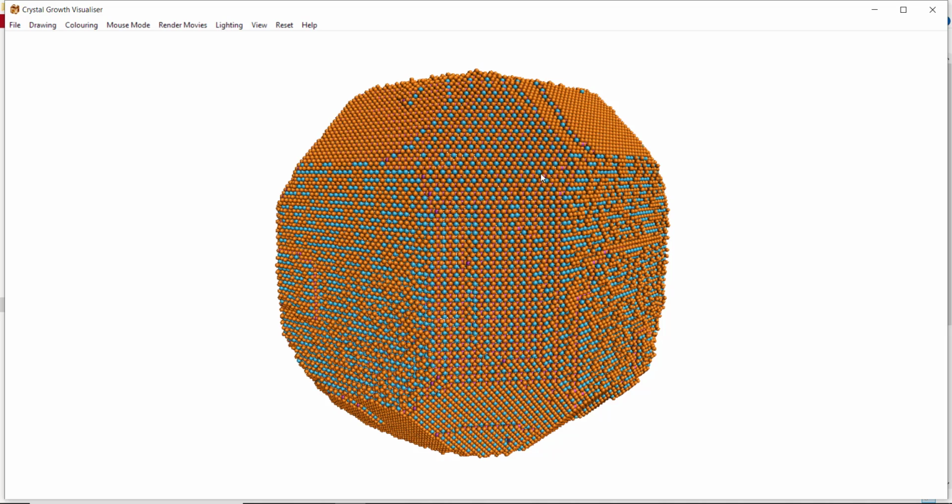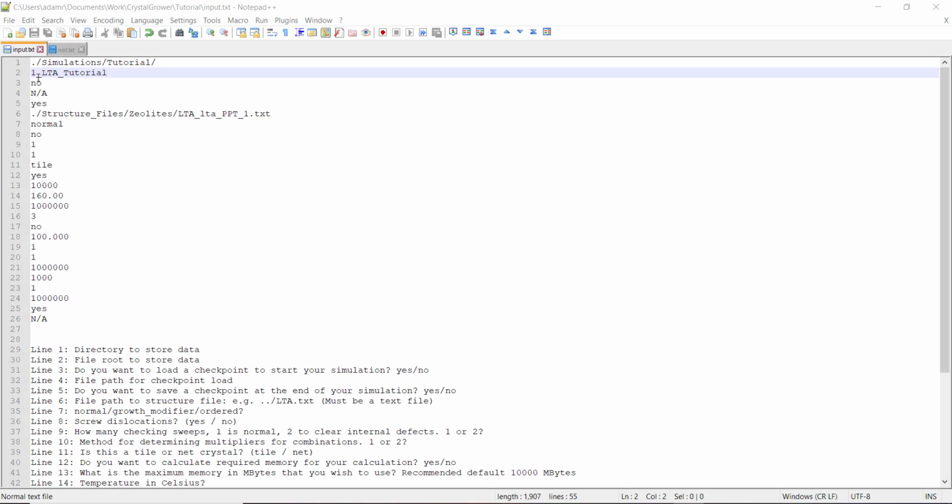There's another series of videos explaining how to use the CrystalGrower visualizer, but how much of an effect does the free energy of crystallization for the tiles have on the overall morphology? Let's try running another simulation where we assign all the tiles the same energy penalty and see what different morphology we get. So I've gone back to my input.txt.